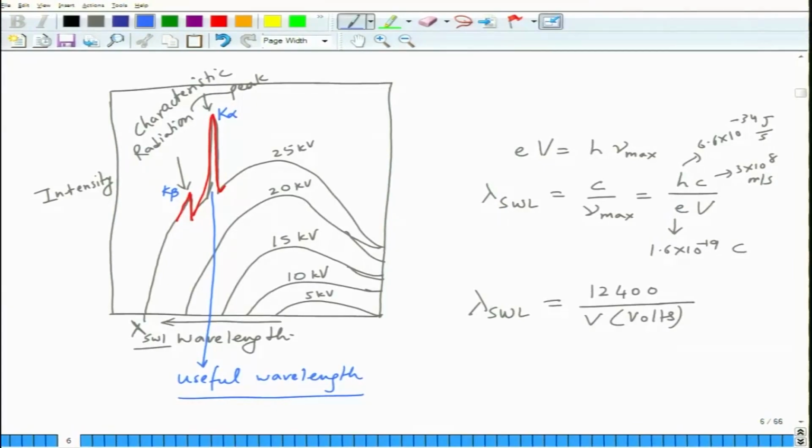There could be other peaks as well, other minor ones like L alpha, L beta and so on, but they are not as intense, and they will probably be lower in energy as well. L would be a transition from K, L, M, N, so M to L, right?